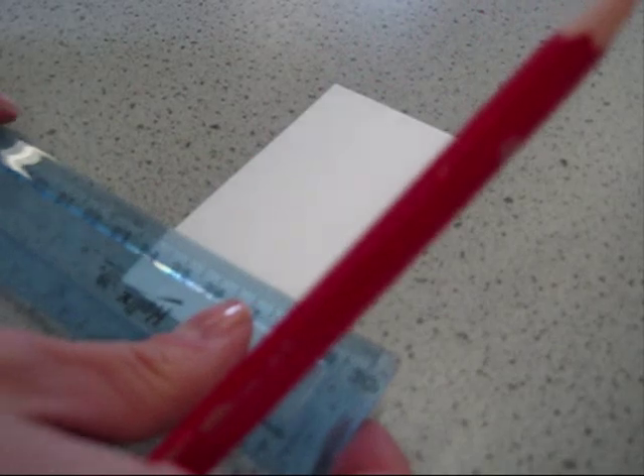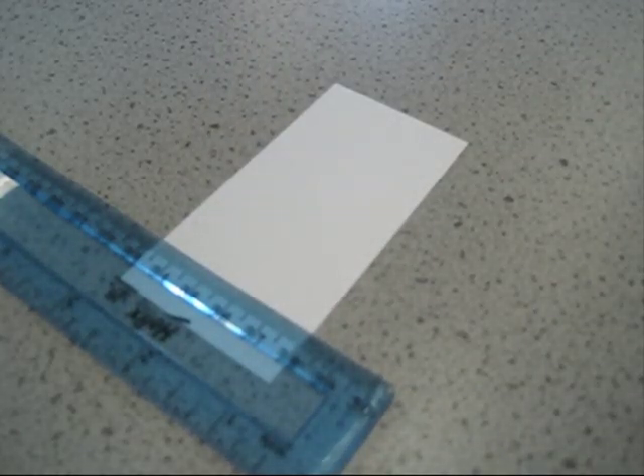Firstly, we take our TLC plate and we draw a line approximately one centimetre from the bottom using a pencil and a ruler, like so. Gently draw the line. Do not use a pen when drawing on the TLC plate as this will run in the solvent, and do not press too hard.